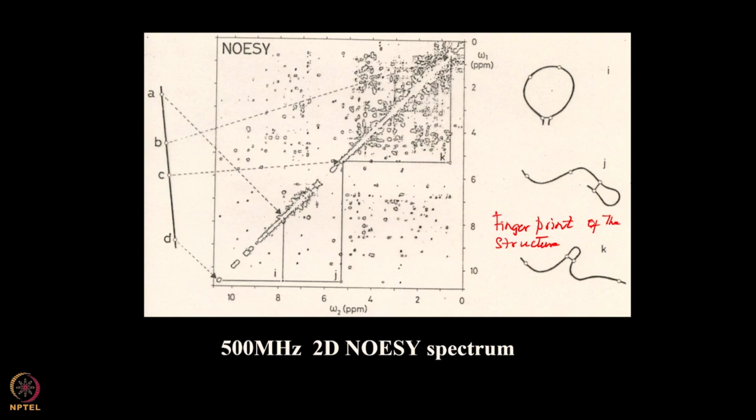This has been the basis of structure determination of biological macromolecules, whether it is protein or nucleic acids or carbohydrates or whatever it is, it does not matter. So, in every case you will see such kind of peaks.